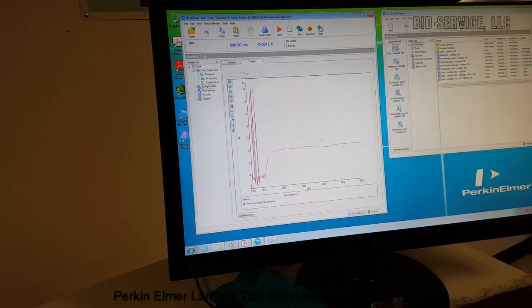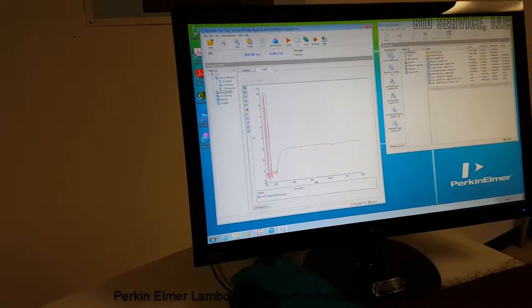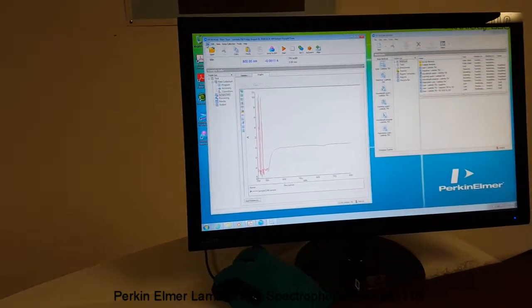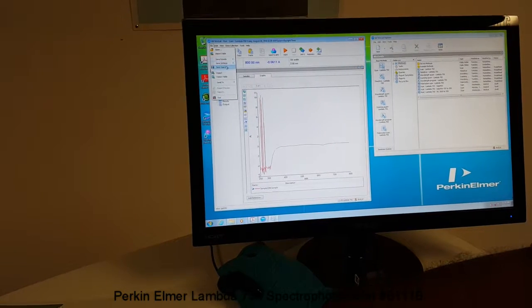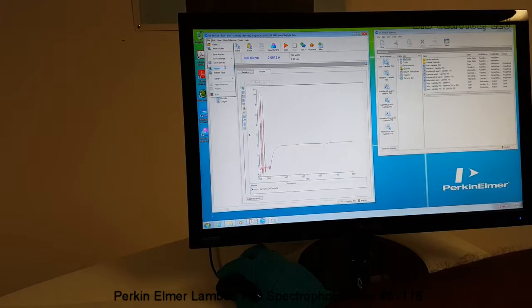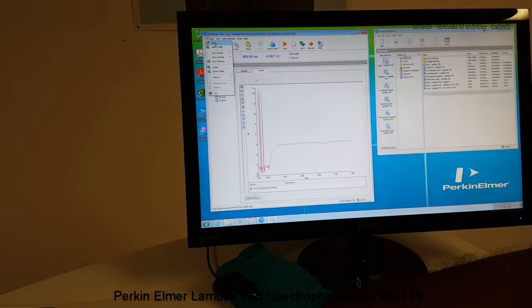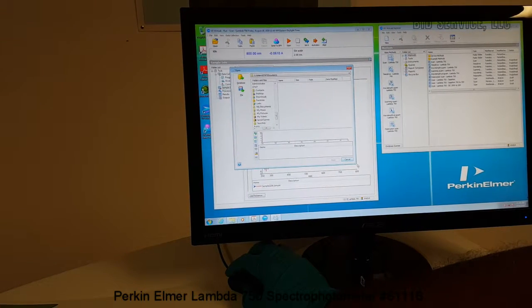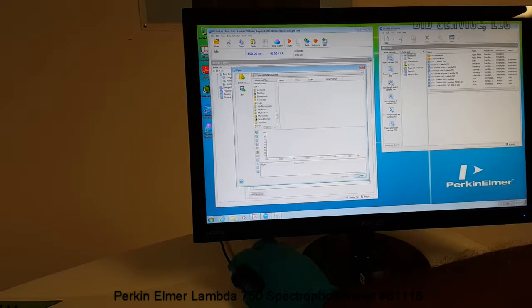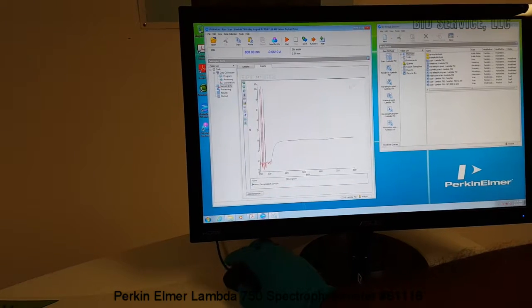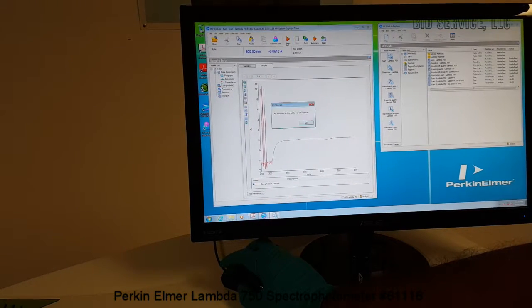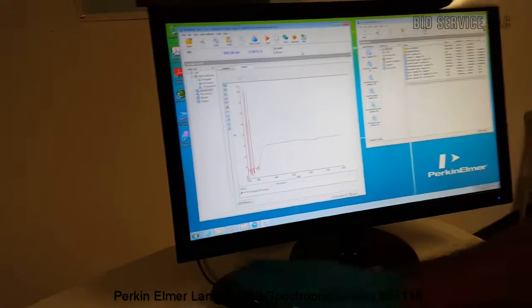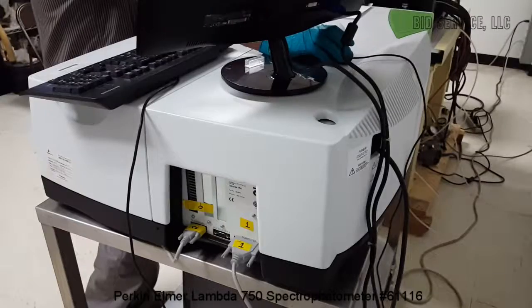So once the plot is complete, we can save the task. Several features exist in this machine, and the detail manual will describe the operation. And that's it.